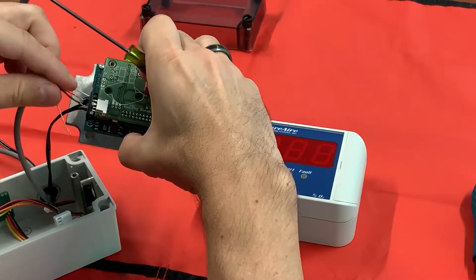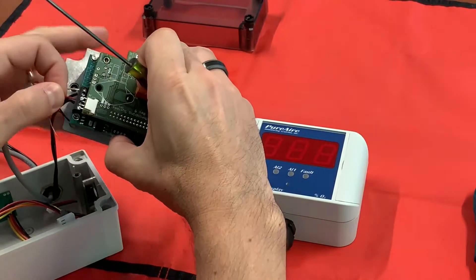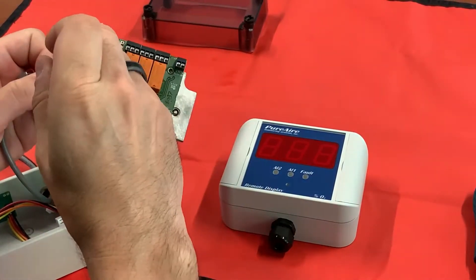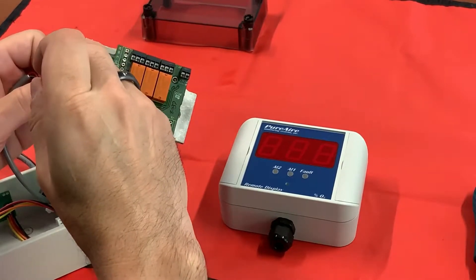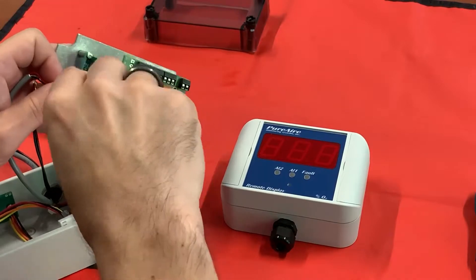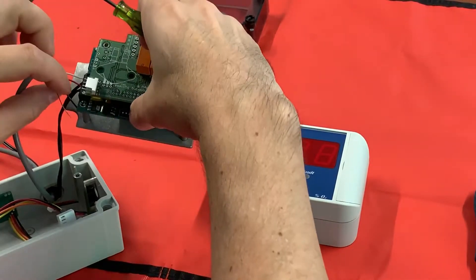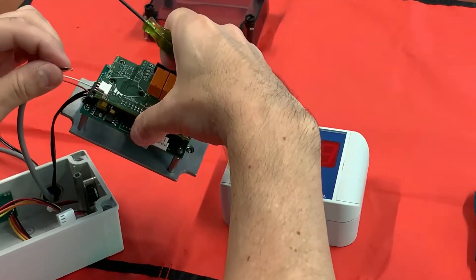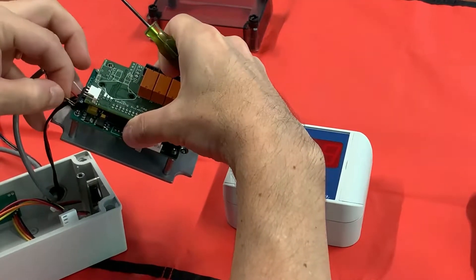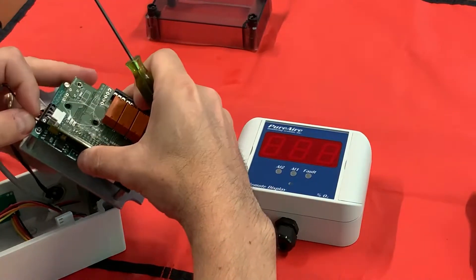Then I'm going to use my red as my milliamp signal — that one goes in the middle terminal lug. Go ahead and tighten them down pretty tight. Then for the ground, you're going to connect your shield and your ground both in the same terminal lug.